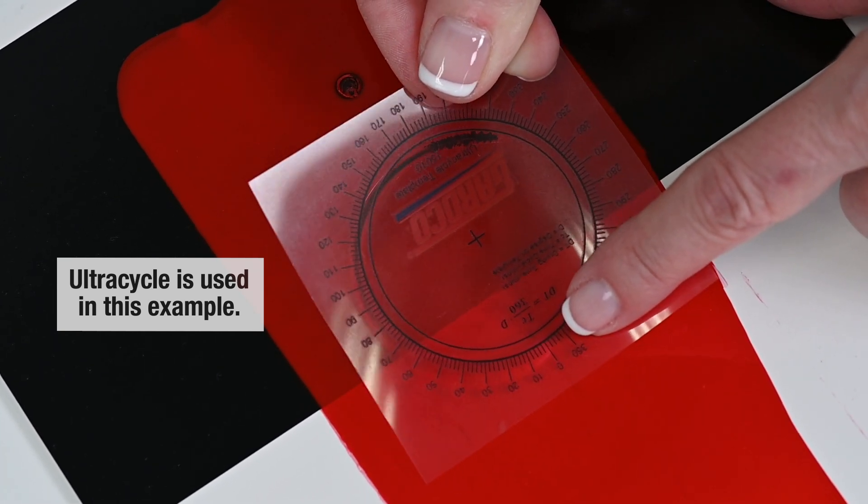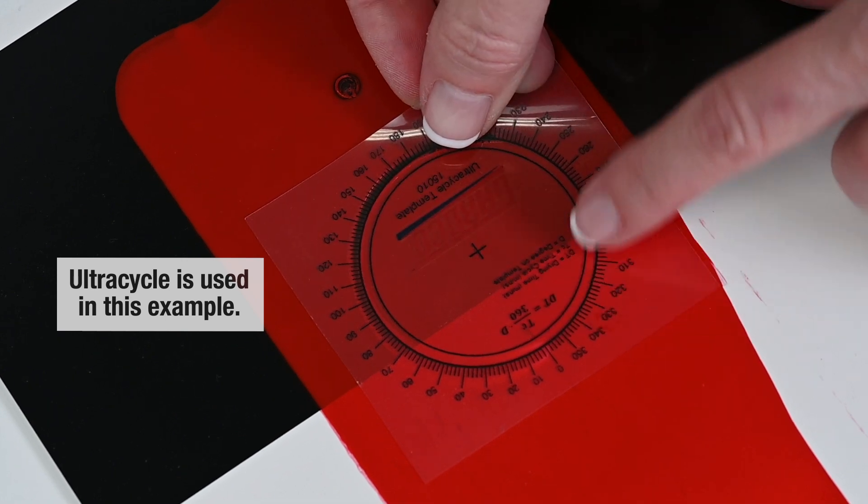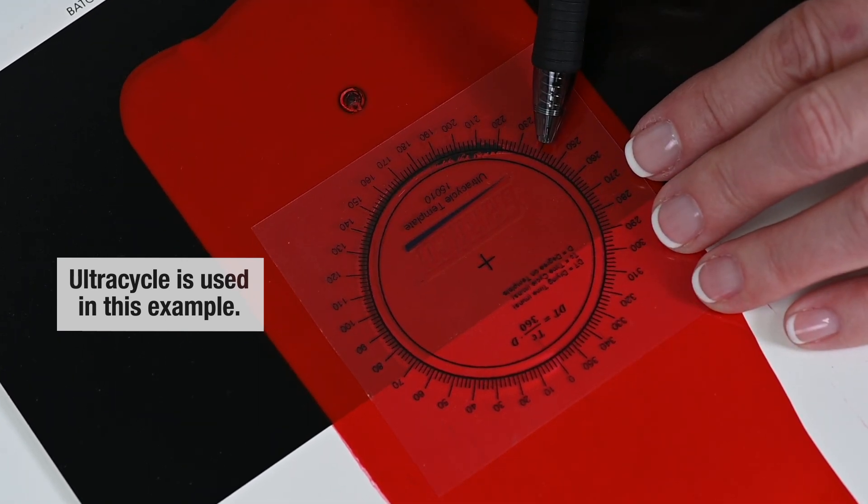Determine where the applied coating cured and note the time on the template to find the drying time.